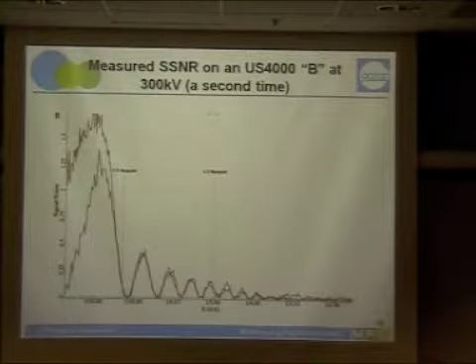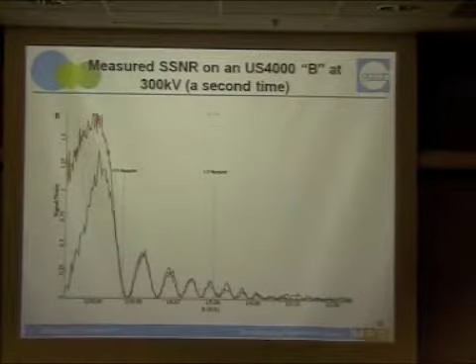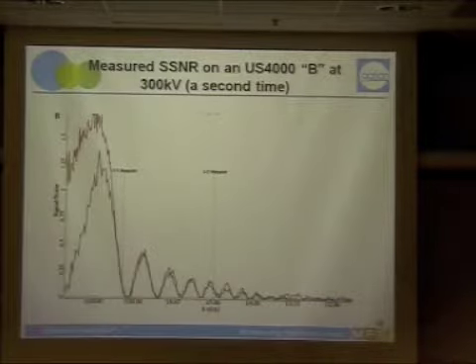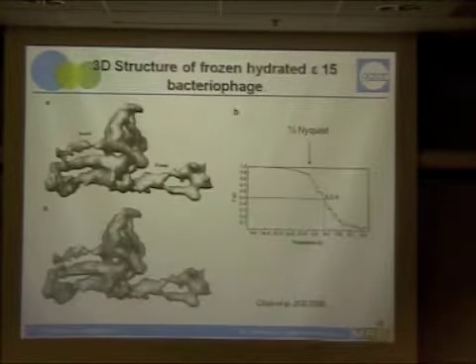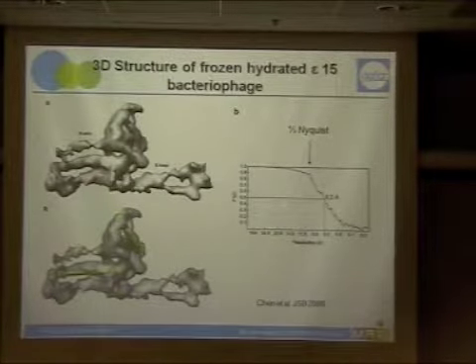And so we weren't sure what to make of it, we got excited. We ended up publishing this work, and then about that time, that's when I left WASLab and joined GATAN. So fortunately for me, Donghua Chen carried on and collected a data set on this camera at 300 kilovolts.